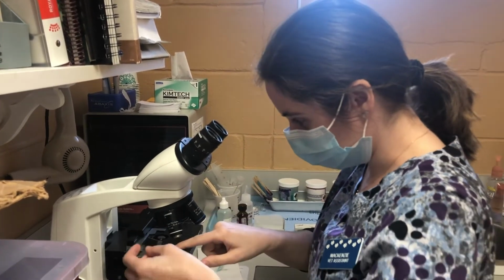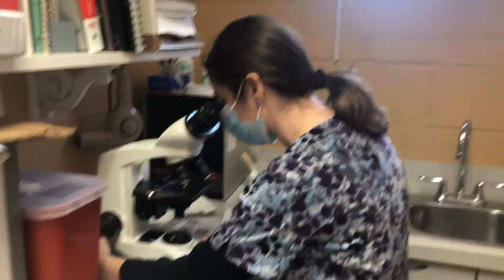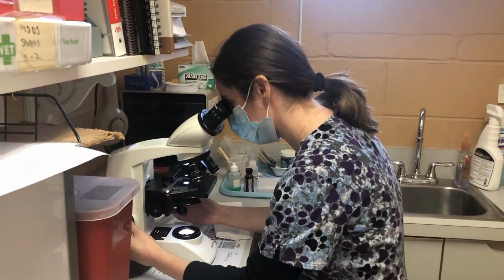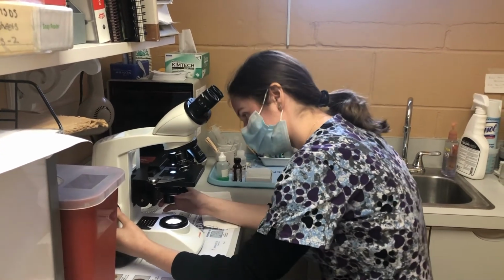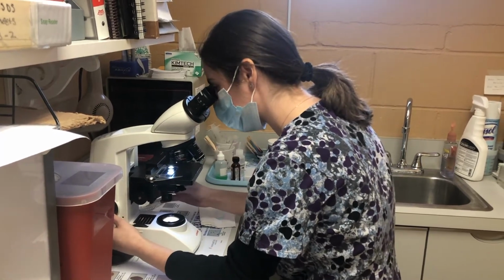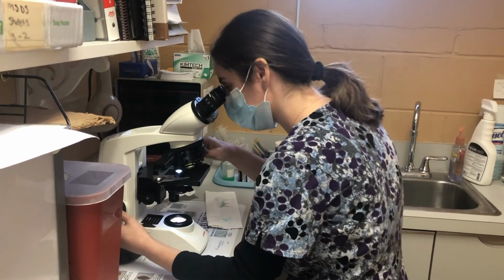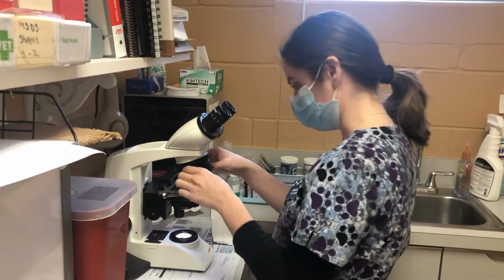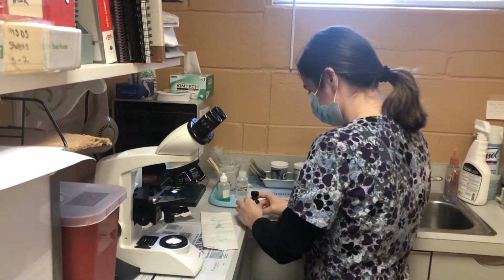So now I'm going to place my slide under the microscope and get it under the lowest power right now. Find my place. Into my next highest power. And now I'm going to use my immersion oil.